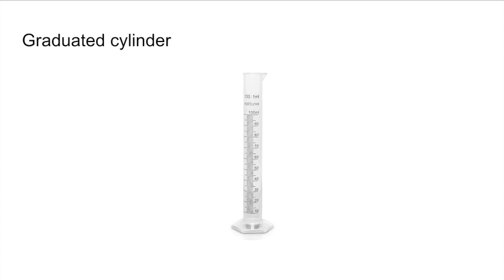Graduated cylinders are often used to measure the volume of a liquid. Graduated cylinders are generally more accurate and precise than laboratory flasks and beakers, but they should not be used to perform volumetric analysis. Volumetric glassware, such as a volumetric flask or volumetric pipette, should be used, as it is even more accurate and precise.